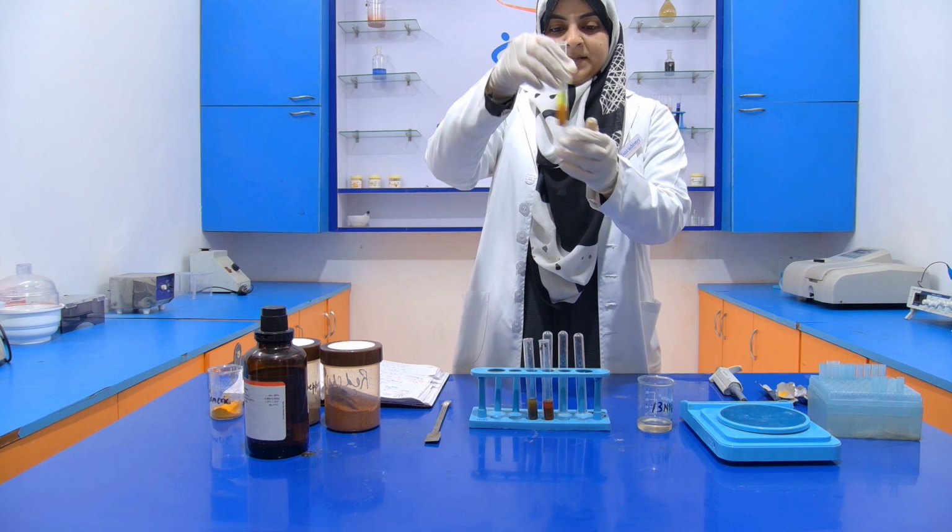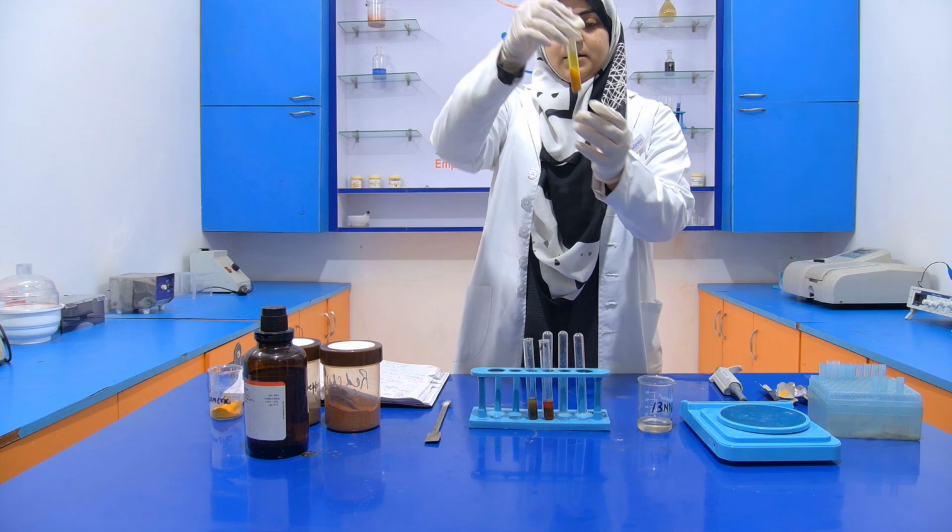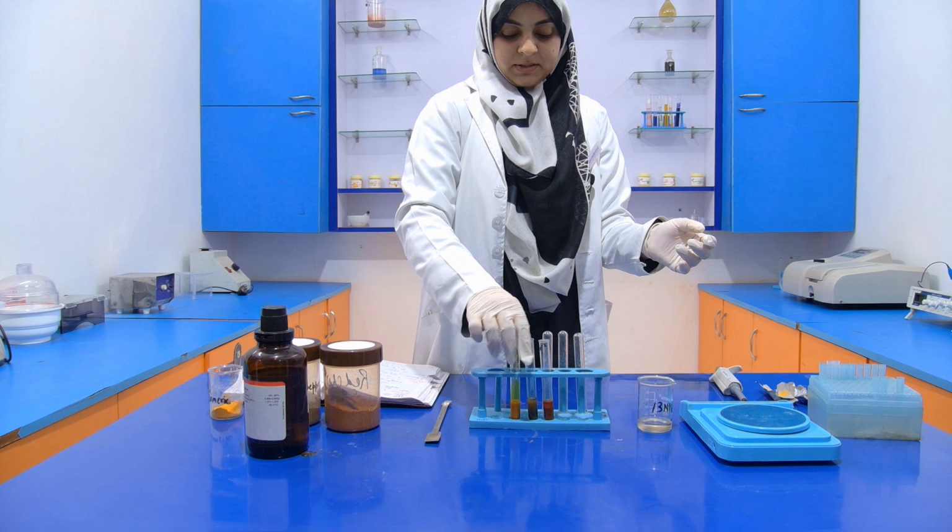You can see that if the color is there, then it will be extracted by the petroleum ether.